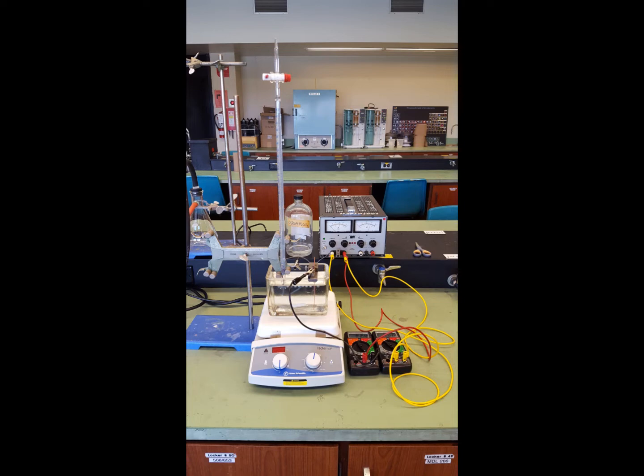And that copper plate is, you'll see, connected by an alligator clip and a black cable which directs it in series through an ammeter. So the ammeter is connected in series. You see the black cable going into the ammeter and the red cable coming out. That red cable continues on and goes to the positive terminal of this 6-volt DC power supply. We're working on the left-hand side.